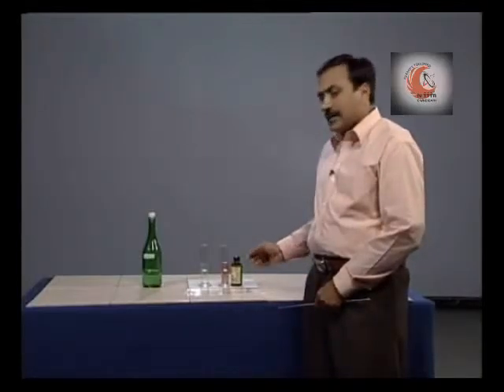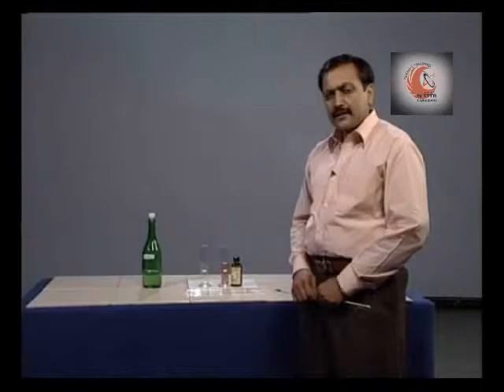Now, this method gives you very quick results, but simultaneously they give quite approximate values. However, for routine analysis they provide a good guideline. In order to make precise measurements, we must adopt the iodometric or spectrophotometric method. Thank you and goodbye.